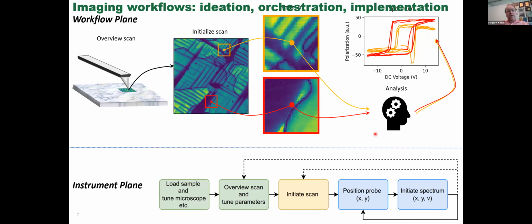The same problems appear in the context of scanning probe microscopy. It's basically a toy model for more complex physical synthesis and characterization, but you can get the gist of the idea even in this case. Imagine that I run the microscope, I image some part of the sample, I try to find out what part of the sample is interesting, so I can zoom in and zoom out.